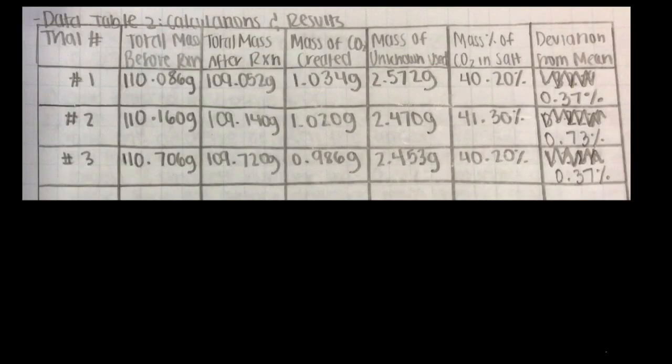So here are some sample student data, and I just want to show how we're going to get this mass ratio using some actual numbers. So you can see the student has done 3 trials, and for each trial they have calculated the mass of CO2 produced in that trial, again by doing the mass difference between the reactants and the products. And then along the way, they also have calculated the mass of unknown compound that they've used. So that's the alkali metal carbonate that they started with at the beginning, before the reaction.